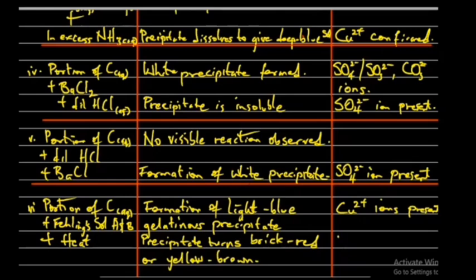This confirms that there is presence of reducing sugar.